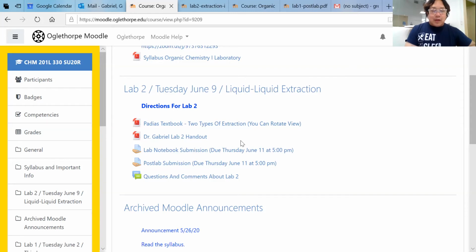And we can make molecules more or less soluble in either of those two layers by possibly protonating the molecule or deprotonating the molecule, making it charged. That's for lab 3 actually. In this lab 2, we're just going to focus on the technique and practice taking good observational notes in your lab notebook. Let me show you the handout.